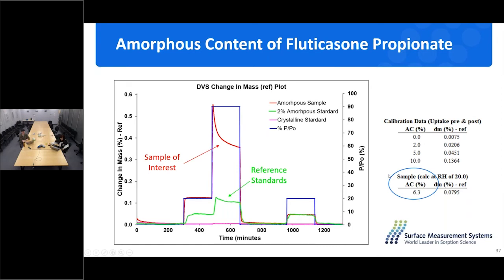And if you have a different kind of material or a different kind of solvent that induces the crystallization inside the material, we do have some other methods to suit your sample and your probe molecule to calculate the amorphous content as well.